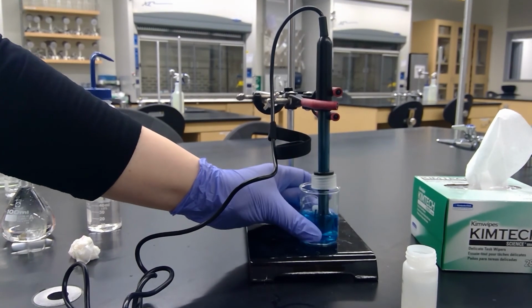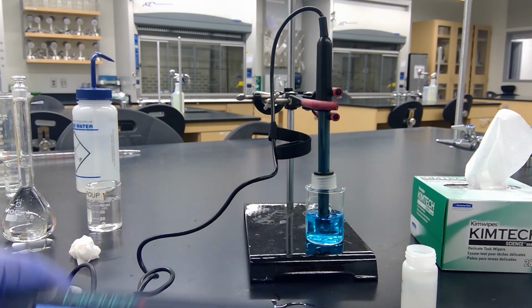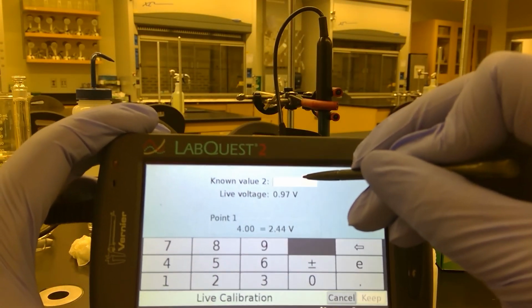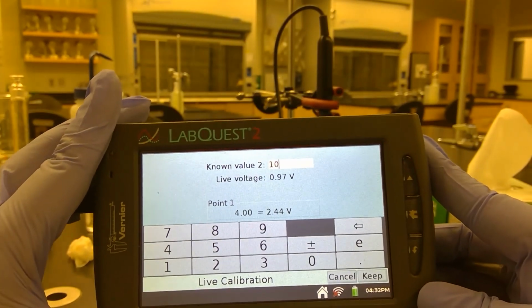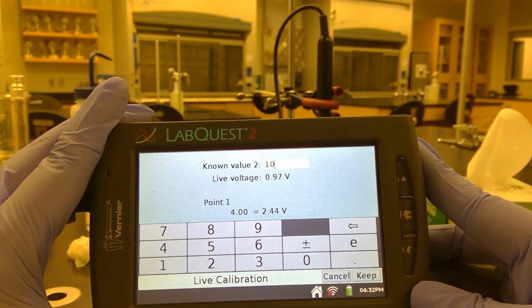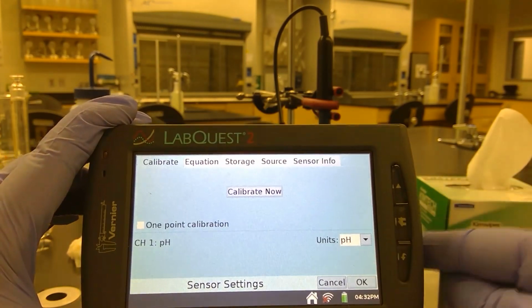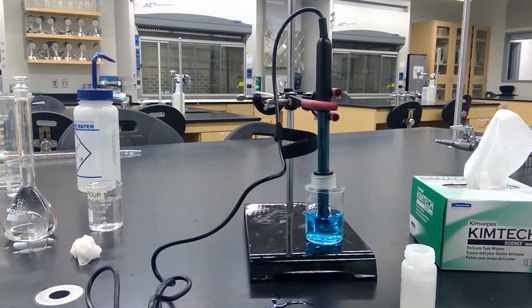And you swirl it. And so we'll type in 10 and wait for the voltage to become stable. It looks stable, so we'll hit keep. All right, so now our pH probe is calibrated.